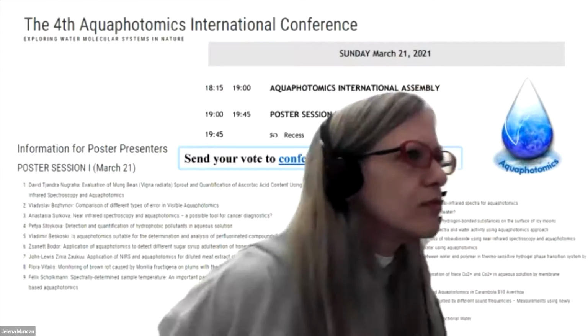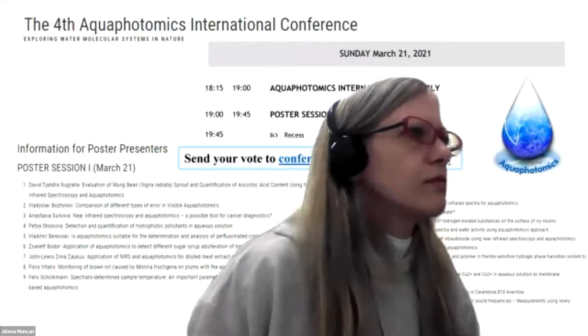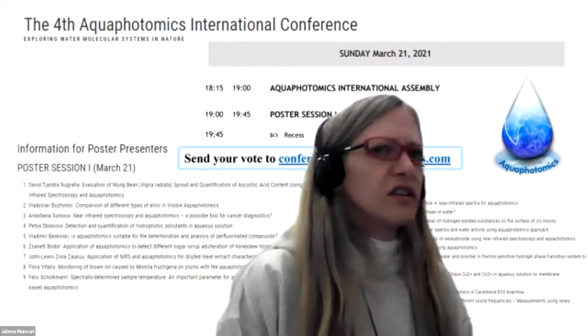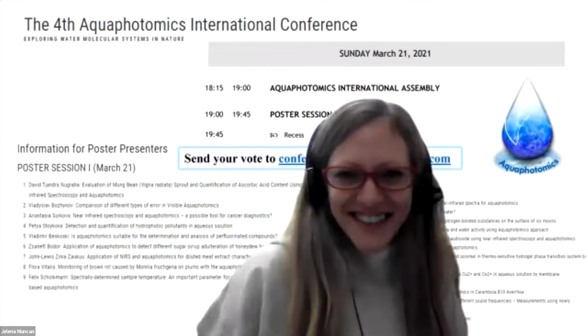And the most obvious one is a change in the environmental temperature, maybe also due to the spectrometer getting hotter or cooler in some different phases. But the other thing, the most interesting thing, is the temperature change happening inside the sample due to some chemical reactions, for example. Yeah, good point. But it's another aspect to disentangle, maybe, these two things. Or we may have to learn to live with that, like Professor Schau is using, I guess.